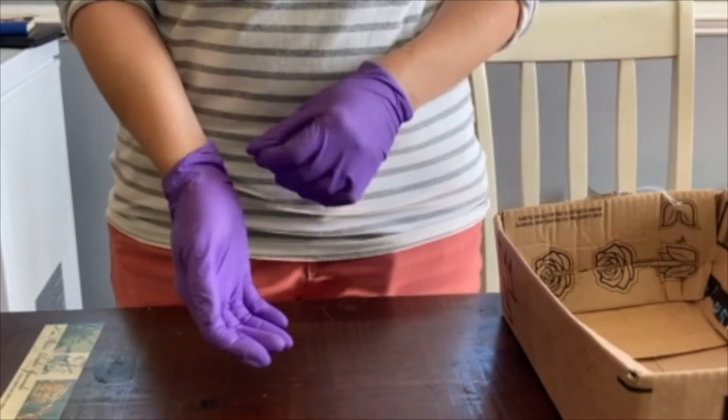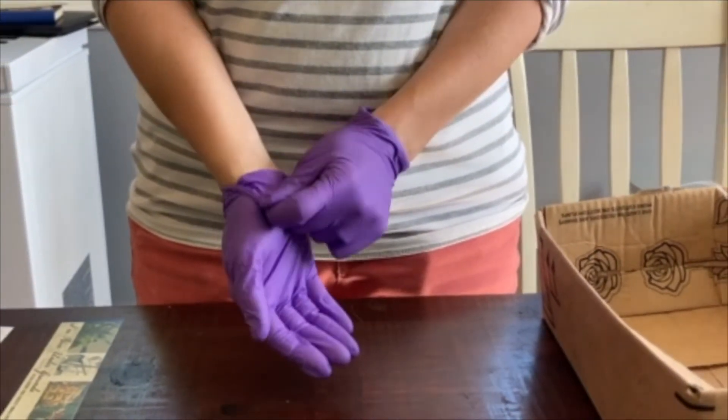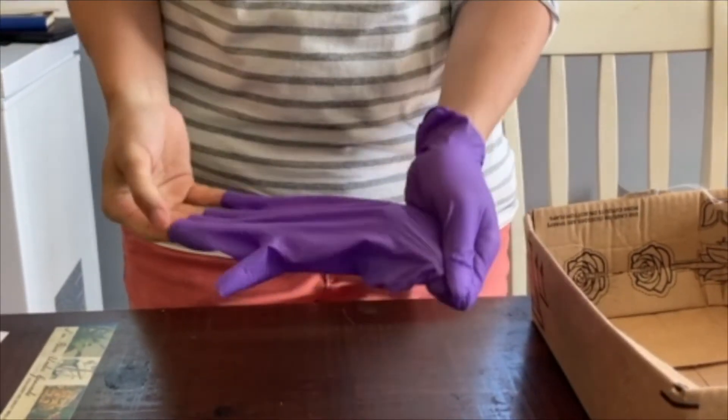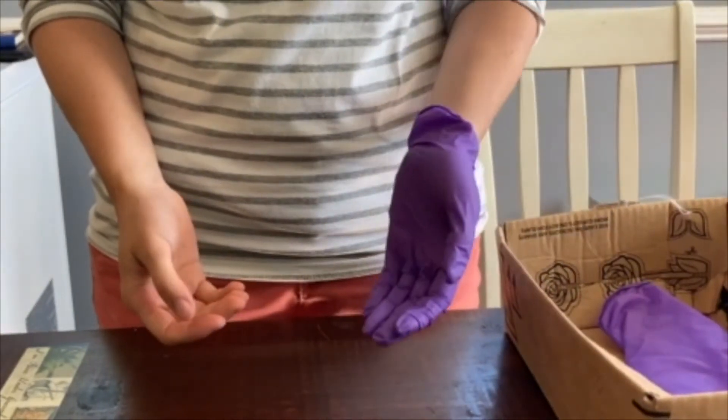When removing your nitrile gloves, grab the wrist of one glove with the opposite hand and gently roll the glove off your wrist inside out until it is completely removed. Then place it in the appropriate receptacle.